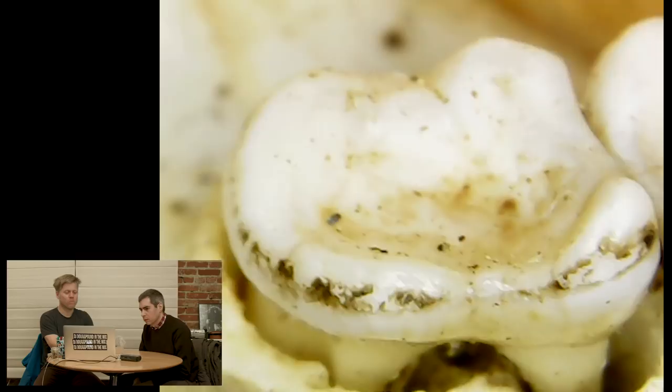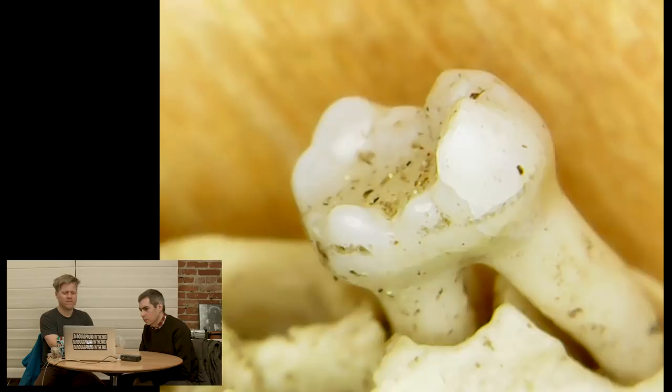Let's look at the bottom jaw. This is the bottom jaw of the squirrel. Look at those teeth. They look like classic teeth in a way — classic teeth, but they're very tiny, just scaled down. I was at the dentist today and I was looking at my teeth, and these look very similar — just scaled down. The same teeth that we've got. These are mammals. That's right. These are our brothers.